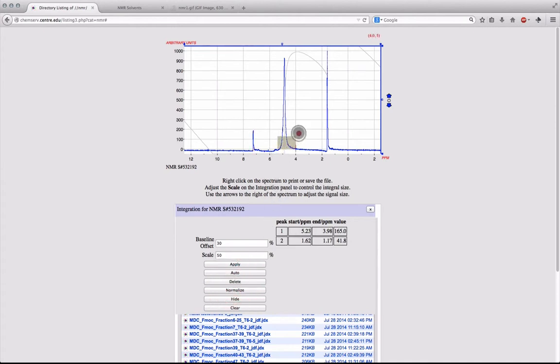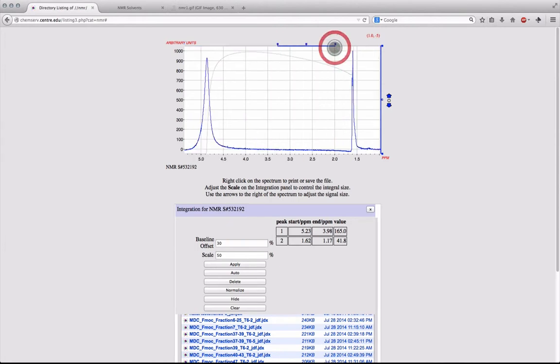After the common solvents have been removed from the signal list, it is important to then select the signals pertinent to your experiment. This can be done by clicking and dragging your mouse within the spectrum viewer.